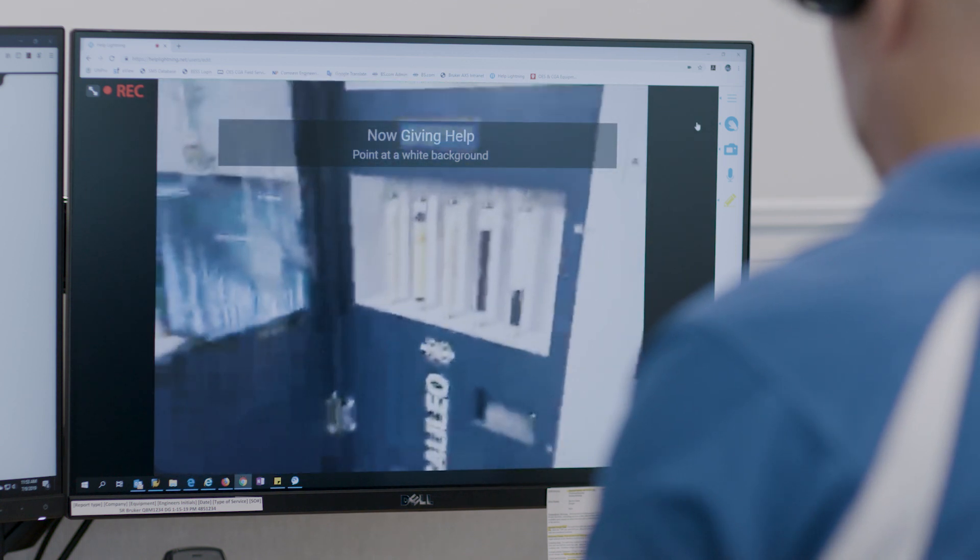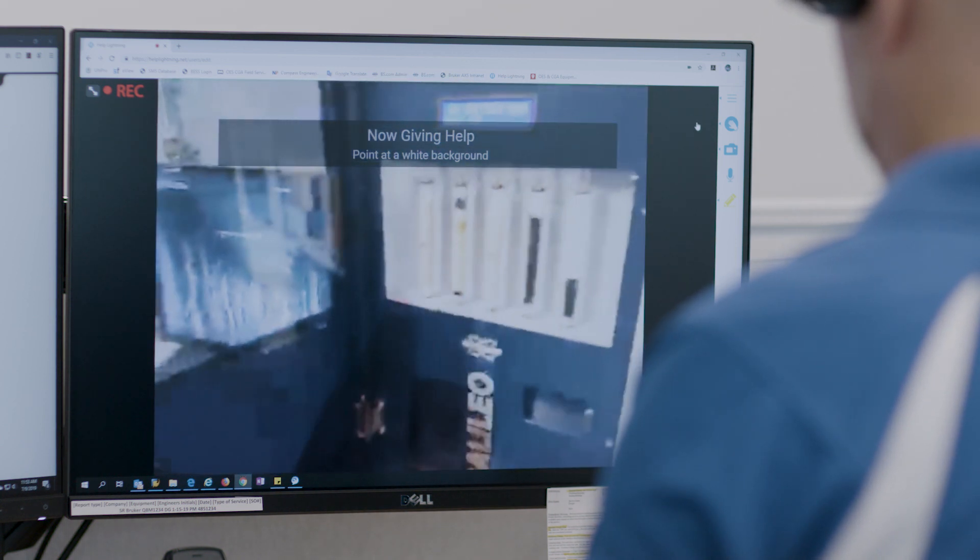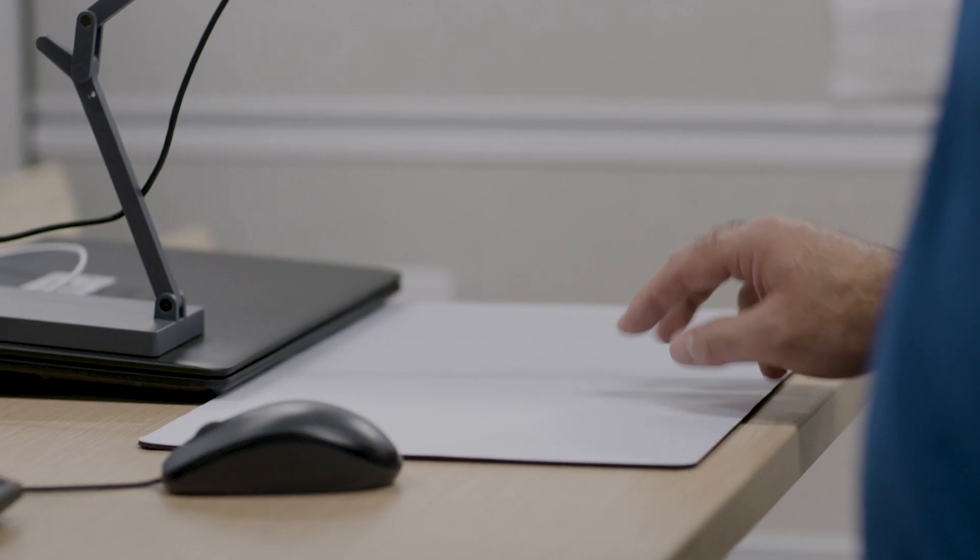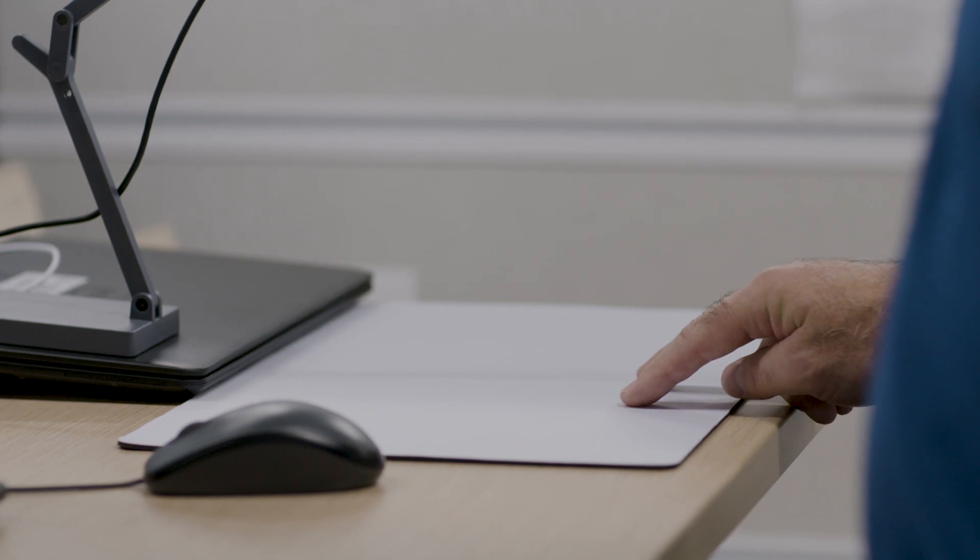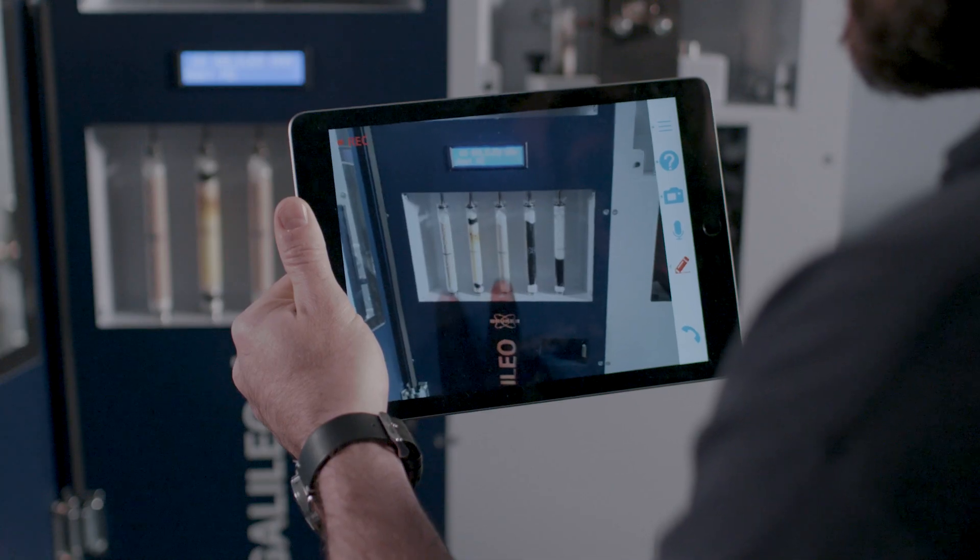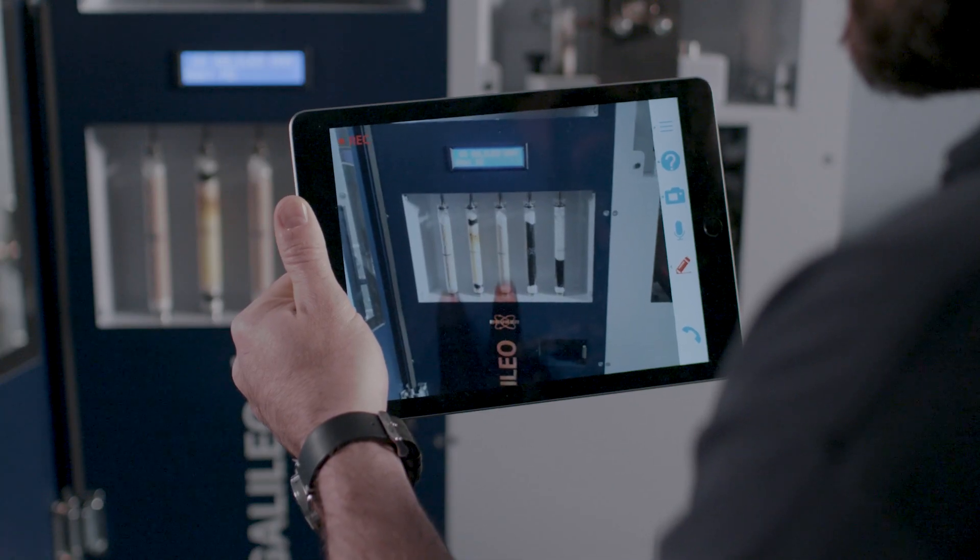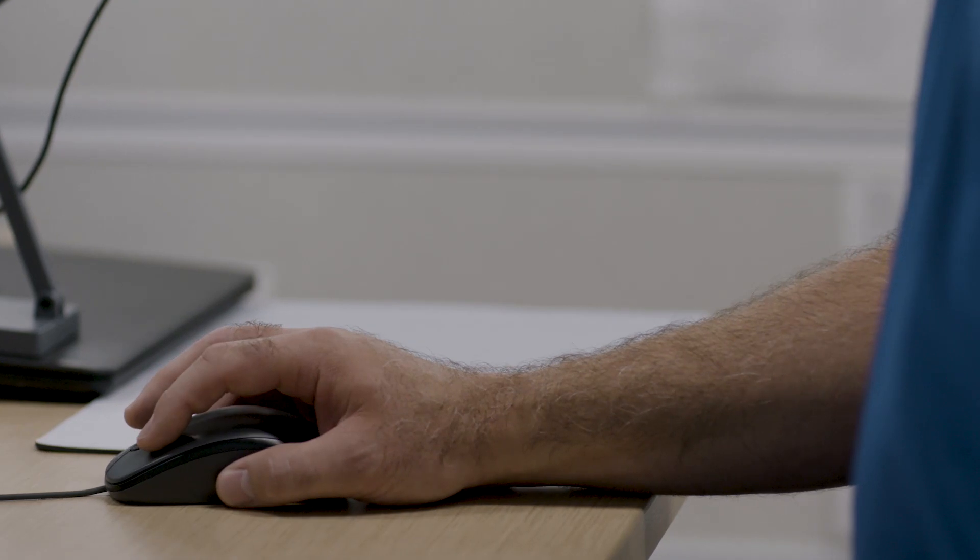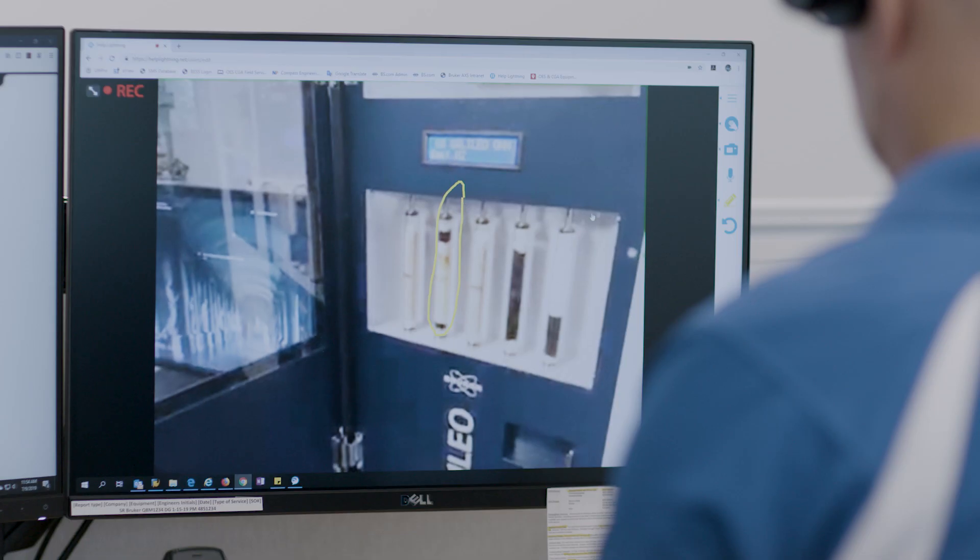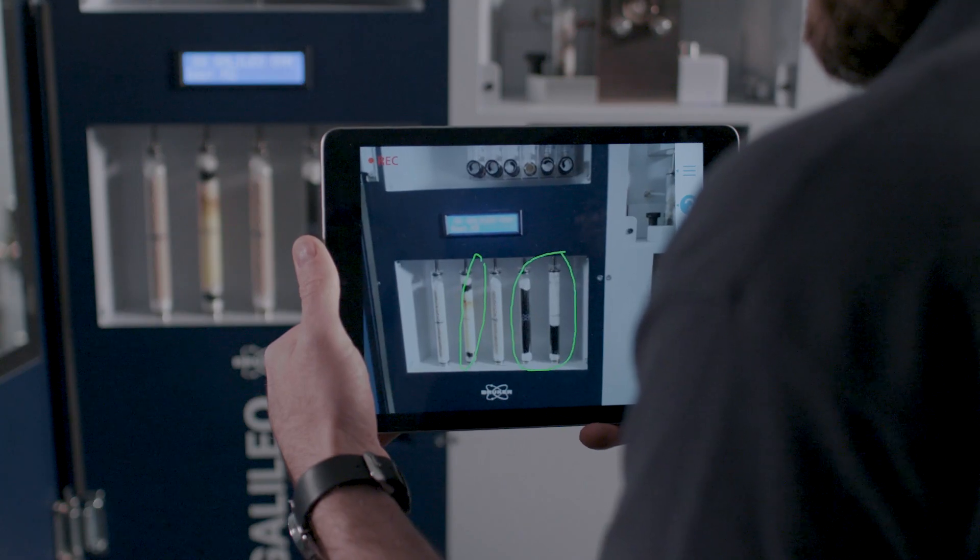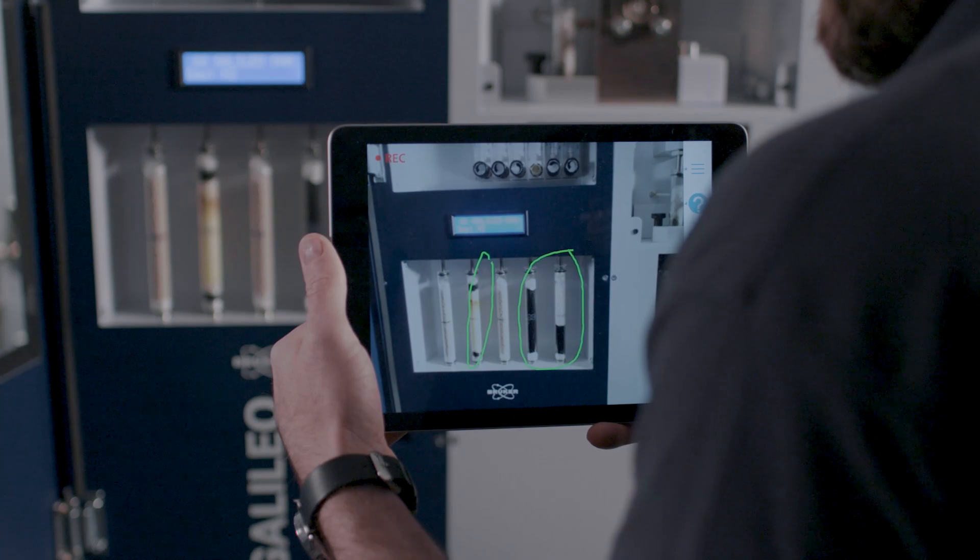Okay, so these are your five reagent tubes here. These first two tubes can be regenerated, but the other three tubes—this one and these two—they need to be replaced.